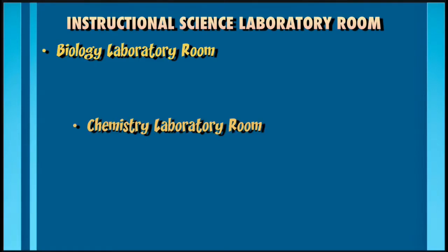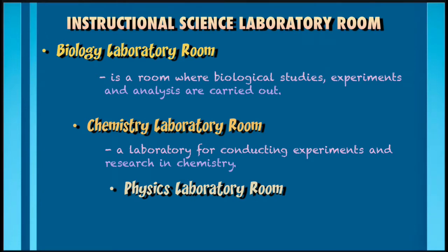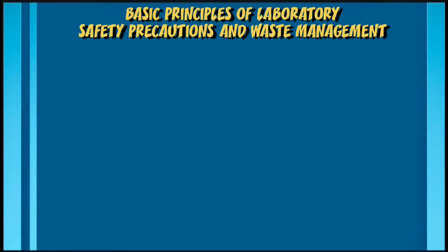Instructional Science Laboratory Room, Biology Laboratory Room, Chemistry Laboratory Room, Physics Laboratory Room. Basic principles of laboratory safety precautions and waste management.